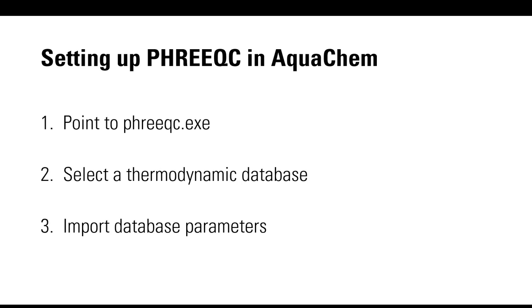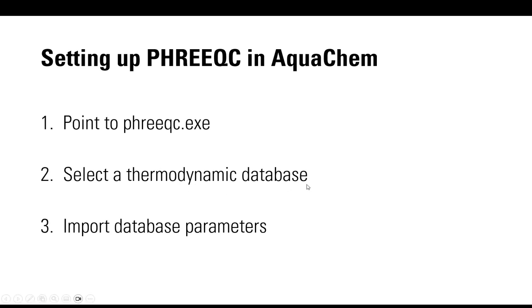The first step is to point AquaChem to PHREEQC.exe. This is the executable file that AquaChem actually uses to run PHREEQC models. It's downloaded from the U.S. Geological Service website. The second step would be to select a thermodynamic database to use with that project, and the third step is to import database parameters in your project so they can be used for modeling.